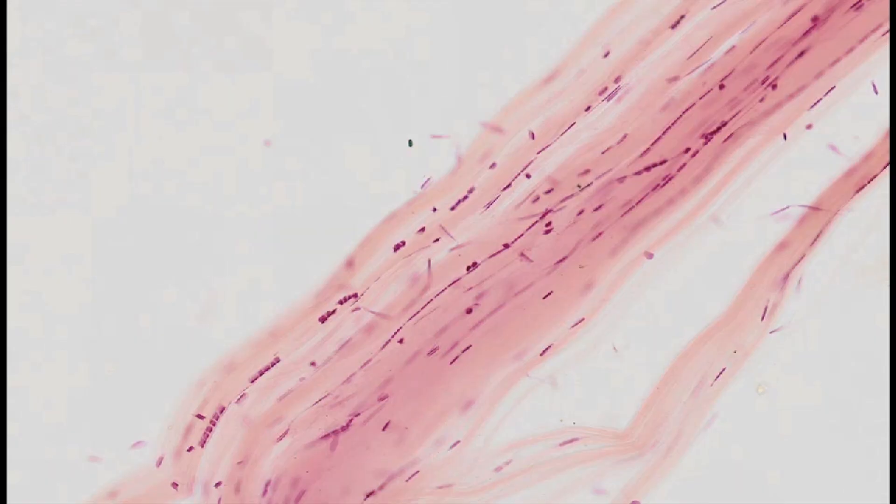Tendon, hematoxylin and eosin staining. A tendon is an example of dense regular connective tissue.